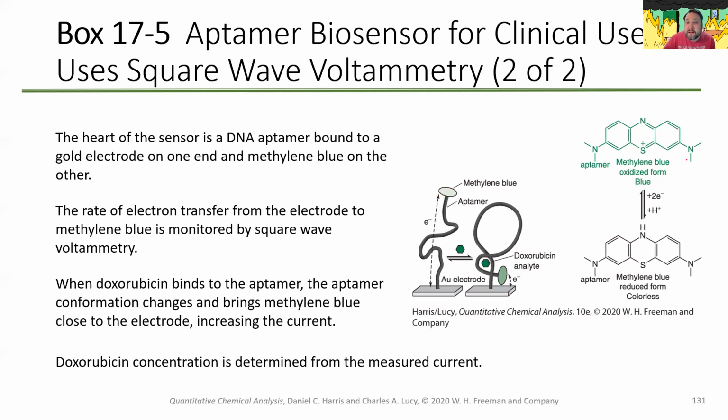We can undergo electrochemistry on our reporter molecule. Right? So our electrochemistry happens with our reporter molecule, and that's going to be related to whether or not this doxorubicin molecule has bound to the DNA or not.